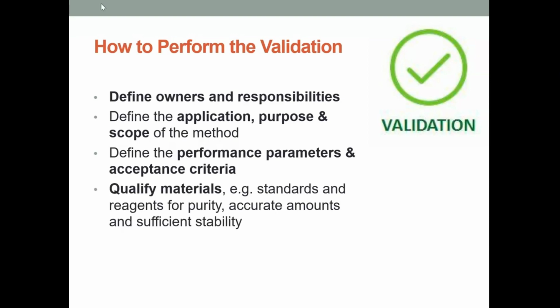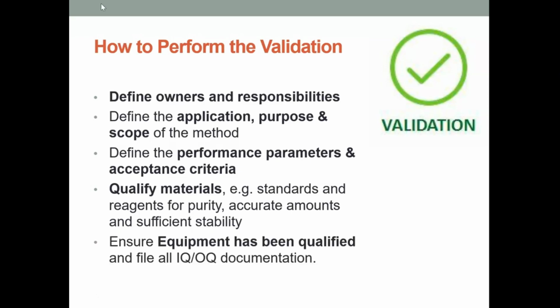We need to qualify our materials. So our standards and reagents need to be qualified for purity. They might need to be certified depending on our accuracy levels. We need to have accurate amounts and they need to be of sufficient stability to last for the duration of the validation. We must ensure that all equipment has been qualified and all of the IQ/OQ documentation must be filed.